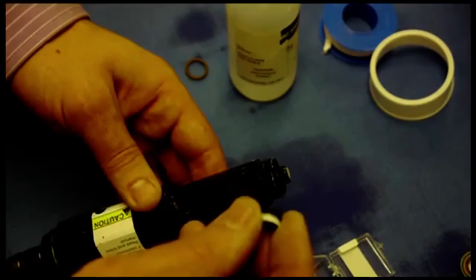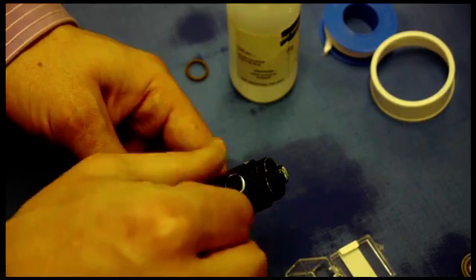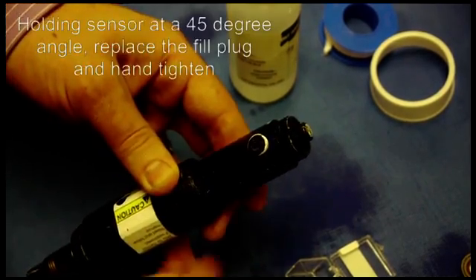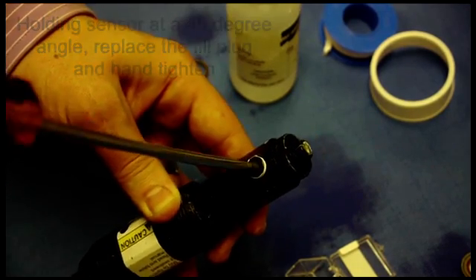Now I need to grab the fill plug which I made sure there was enough pipe tape remaining on. I keep the sensor at about 45 degrees so the solution does not spill out and I begin tightening it.